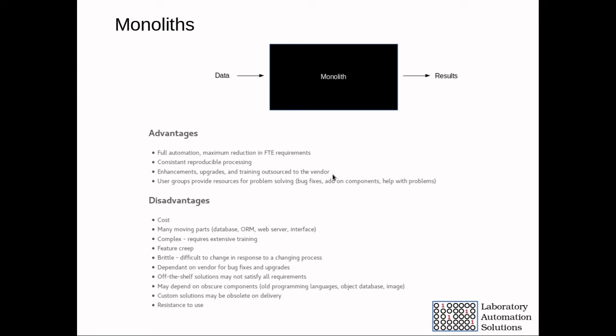All enhancements, bug fixes, and upgrades are outsourced to the vendor. Quite often, user groups provide resources for problem solving.